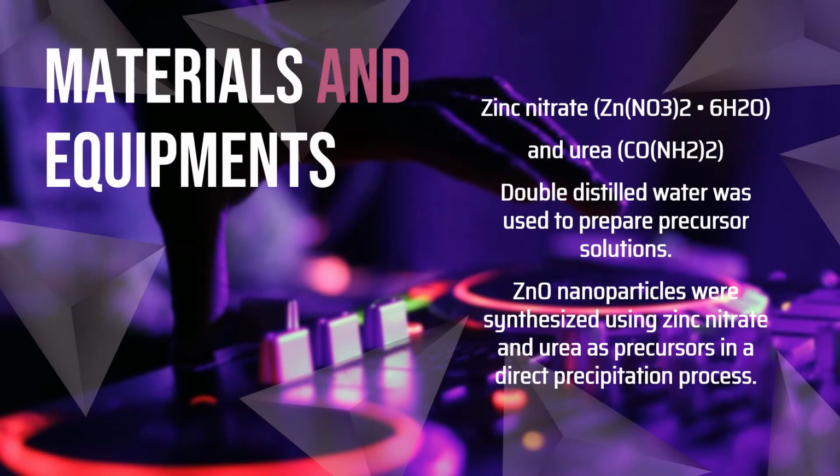Materials and equipment. The zinc nitrate and urea were bought from Fischer Scientific, Germany, and utilized with no further purification. Double distilled water was used to prepare precursor solutions. Zinc oxide nanoparticles were synthesized using zinc nitrate and urea as precursors in a direct precipitation process.